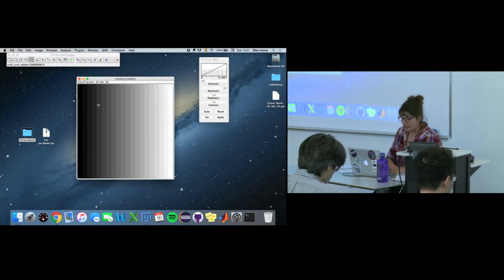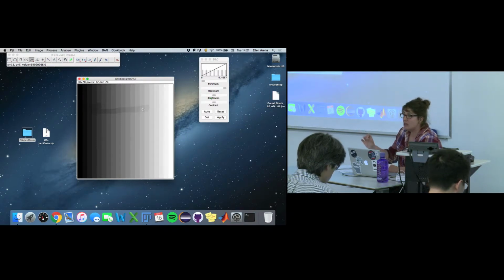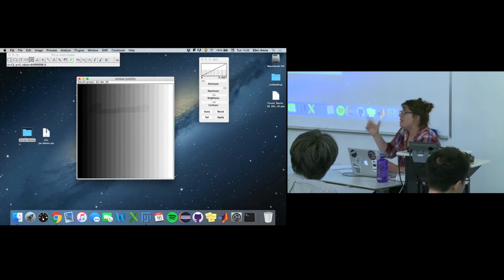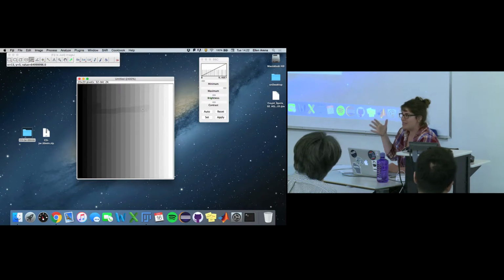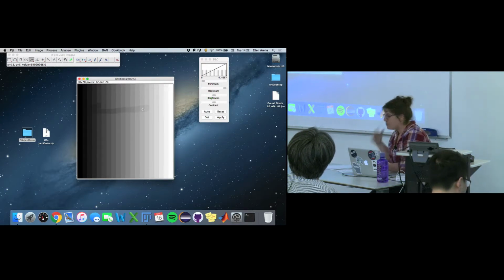So now if we're actually probing the pixels, we can see there's some wonky things going on in our pixel values. Do you see there's some weird results that happened? Yeah, the numbers aren't adding up, right? Because we are increasing the precision in our 32-bit float values, multiplying these small numbers by really large numbers, there's an imprecision there. Computers are discrete. So it's just important to remember that the maths in these cases are not always perfect, which can seem scary, but don't be scared. Okay. So it's an approximation of space, essentially, right?